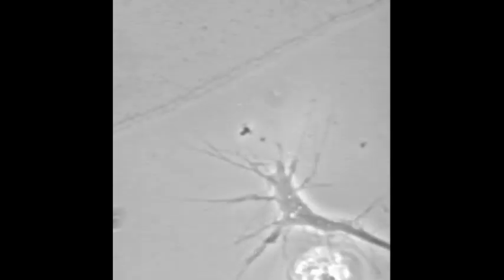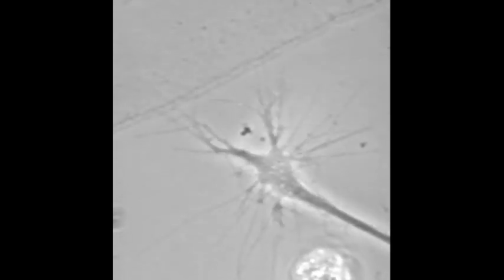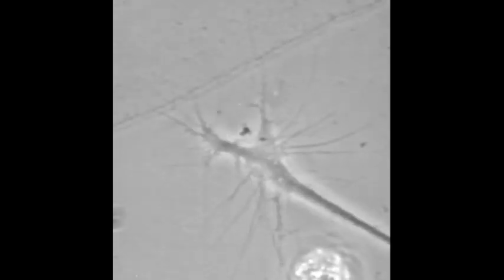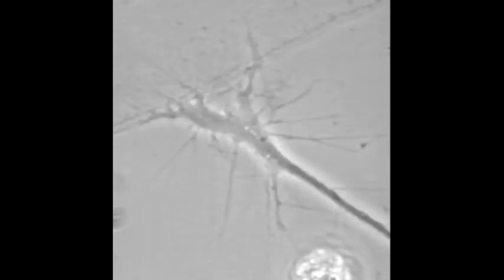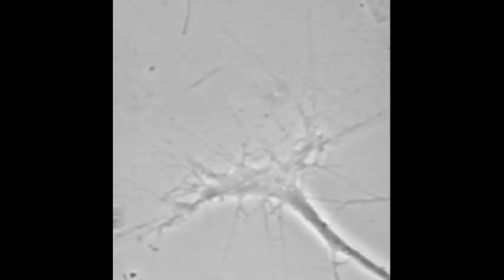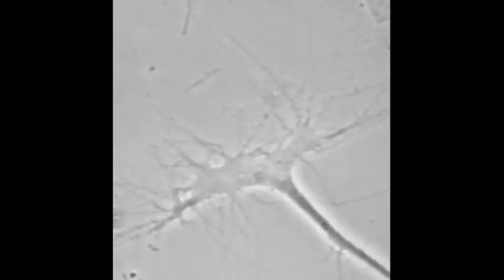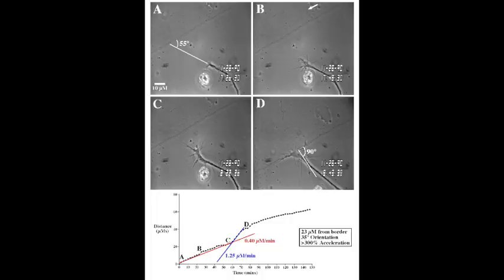The growth cone accelerates towards laminin while still on the fibronectin surface. Microtubules and organelles rapidly advance in the growth cone as it speeds towards the laminin border. This figure illustrates the increased velocity of the growth cone after turning towards the laminin border.